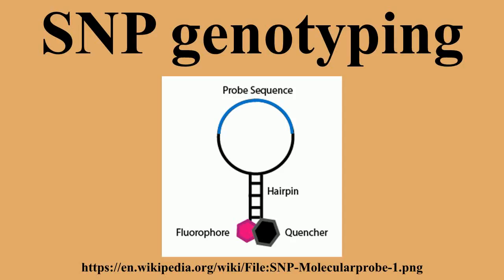Although oligonucleotide microarrays have a comparatively lower specificity and sensitivity, the scale of SNPs that can be interrogated is a major benefit. The Affymetrix Human SNP 5.0 Genotyping performs a genome-wide assay that can genotype over 500,000 human SNPs.